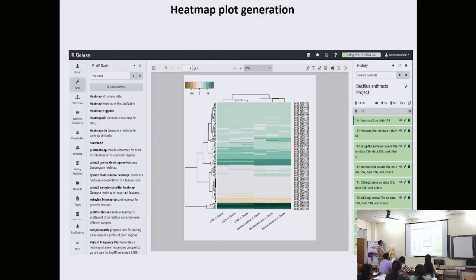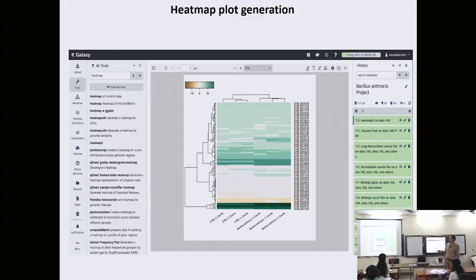And at the top, you have the samples that have also been grouped. So in the heat map, you can do grouping for both the samples as well as the genes. On the top, you have the grouping for samples. So you would expect that the controls should group together. Okay, and they did actually. You see the tree, and the condition samples should group together. They did. Okay, so as expected.